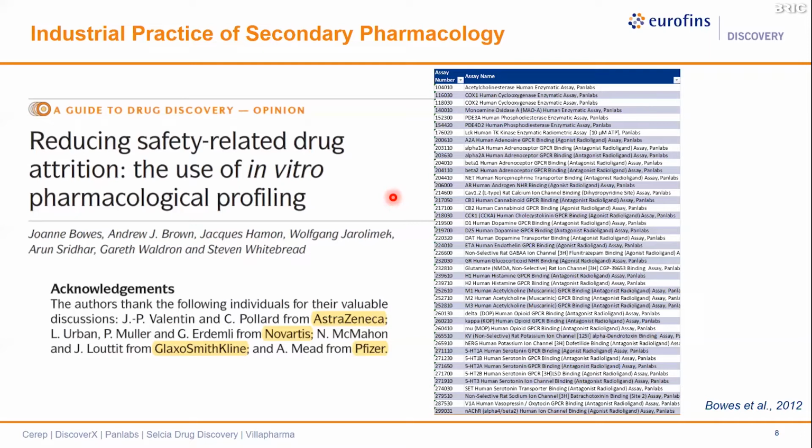So they figured out these 44 targets are important, and at a very early stage, researchers should pay more attention to these targets because they are related to the core battery system and may produce higher risk and adverse effects. So in our safety panel, we include these 44 targets. And later I can show you how we use this panel to do our case study and how this will help you to identify your off-target hits and secondary pharmacology.